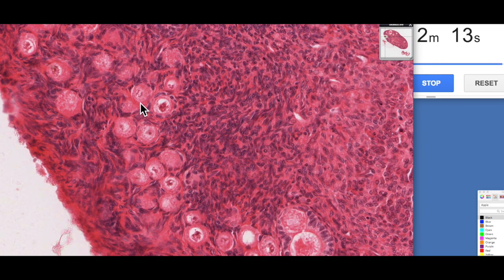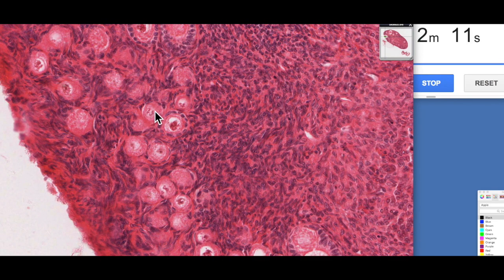So here's the nucleus. Here's the cytoplasm of the oocyte. This is a primary oocyte arrested at prophase one of meiosis one. They're surrounded by these flattened layers of follicle cells. These are simple squamous epithelium known as follicle cells.